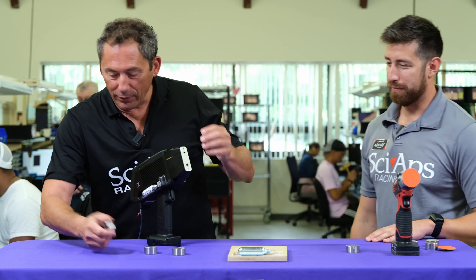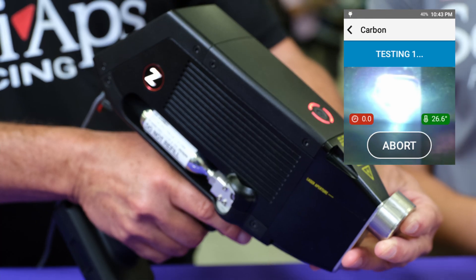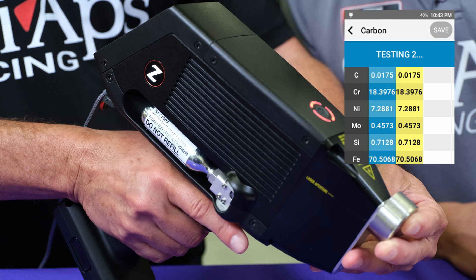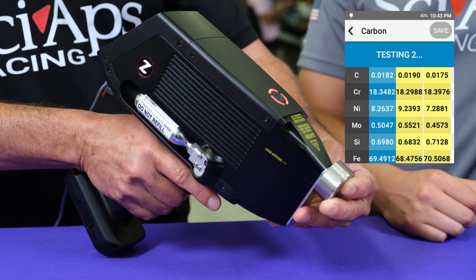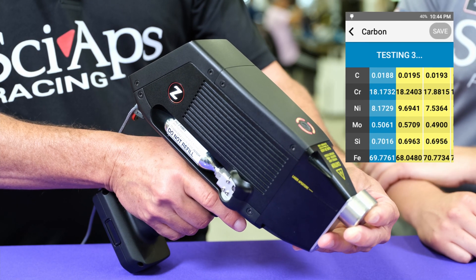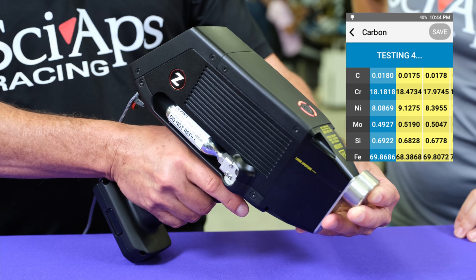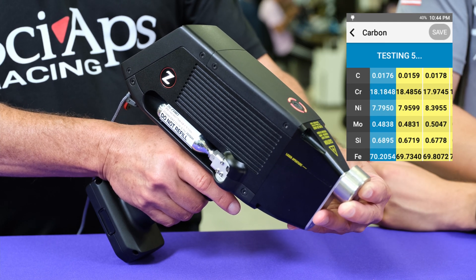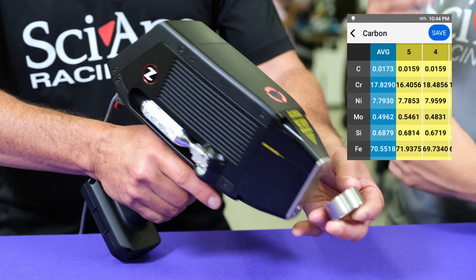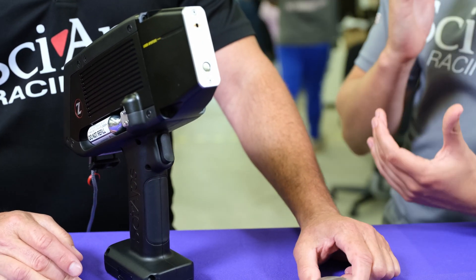Let's take another shot and see if we can get an even better result. That repeatability there is what you're looking for when you're out in the field and you're stressed out, trying to make sure you're getting a good burn on the material. And when you have the repeatability, you know it's a good test.